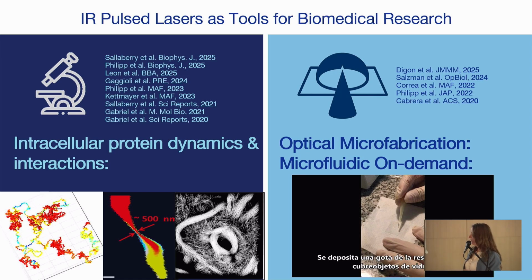And we also apply a lot of fluorescence correlation spectroscopy techniques, from the very basic point FCS to more advanced FCS methods. And we also develop new applications of those methods, most of them in collaboration with Enrico Gratton and his team during the last years.